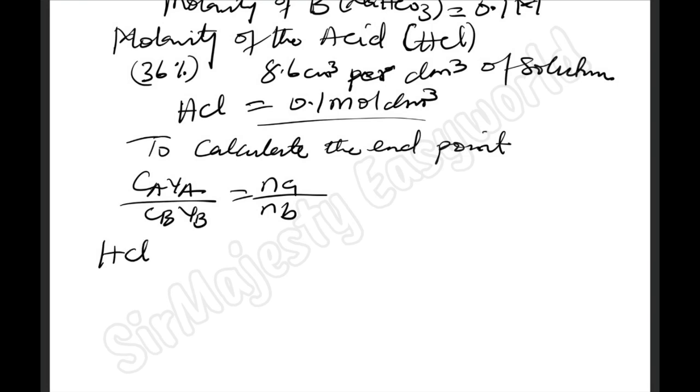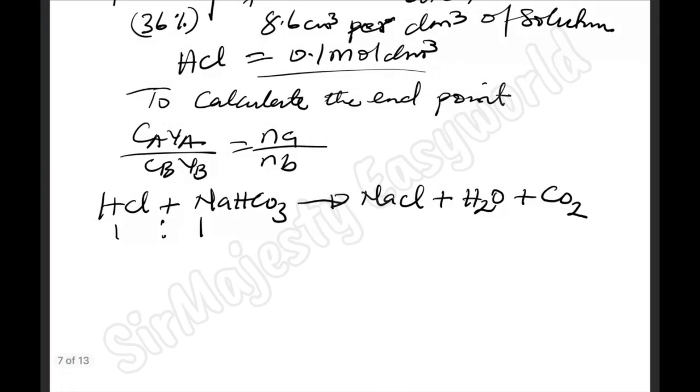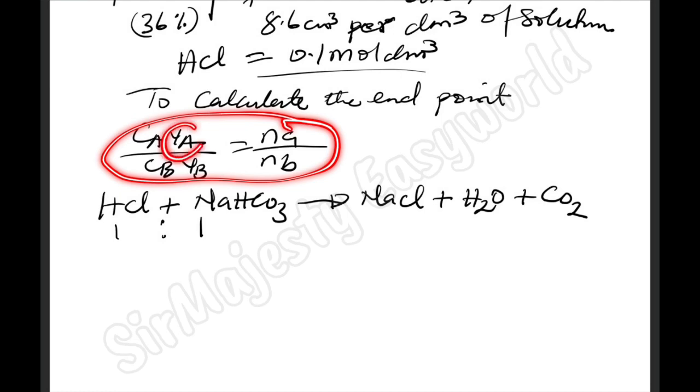So HCl neutralizes the acid salt, sodium hydrogen trioxocarbonate(IV), to obtain a normal salt, which is sodium chloride, plus water, of course, then plus CO2. Checking, the equation is balanced naturally, so the mole ratio of acid to base is 1:1. So our Na is 1, our Nb is also 1. Therefore, we go back to our formula and substitute our values. It's only Va that is unknown.